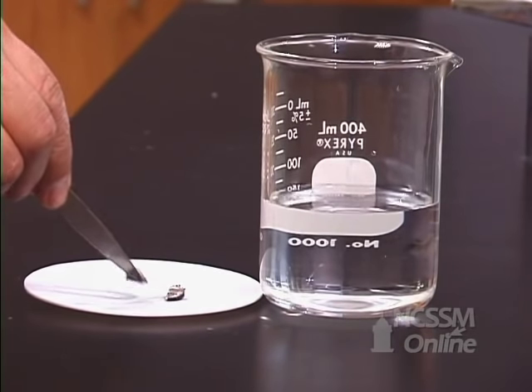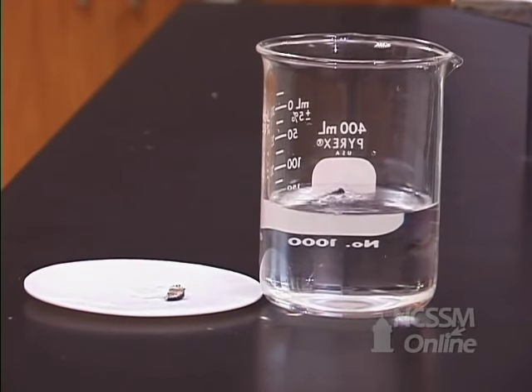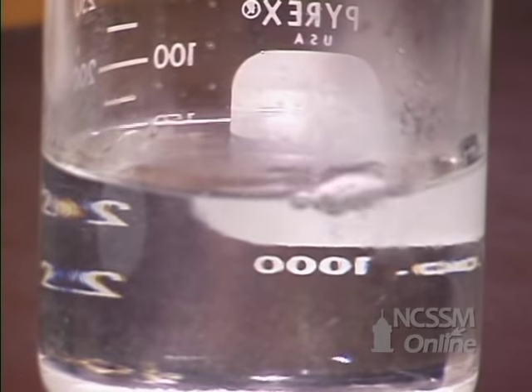If we add a piece of lithium to the water, one of the things that we notice is the fact that the lithium floats. Group 1 metals are less dense than water. We also see that the lithium reacts very rapidly with the water.